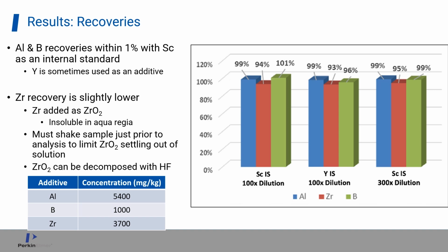It's actually not necessarily a bad thing because yttrium is sometimes used as an additive. So if we're trying to develop a generalized method for how to analyze additives in cathodes, scandium is a better internal standard.